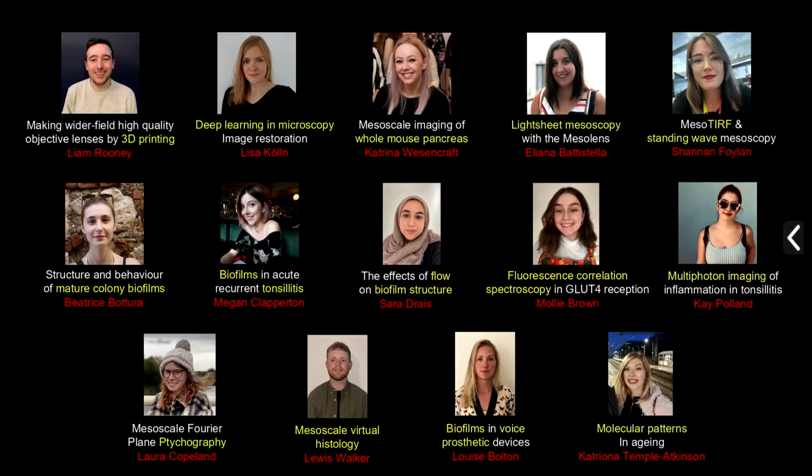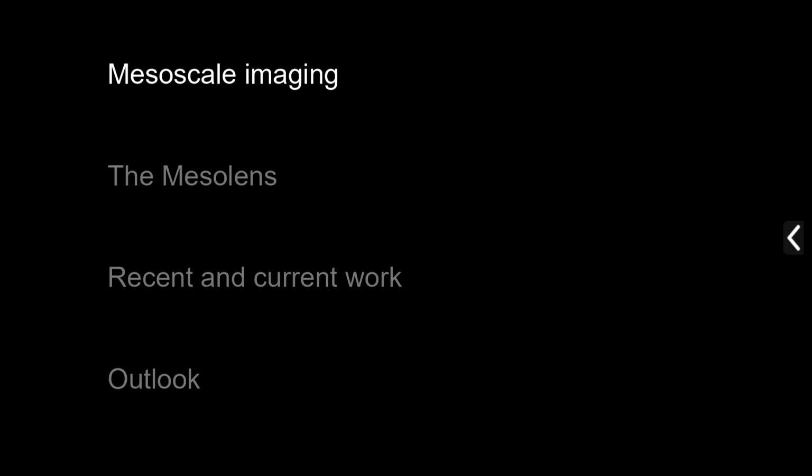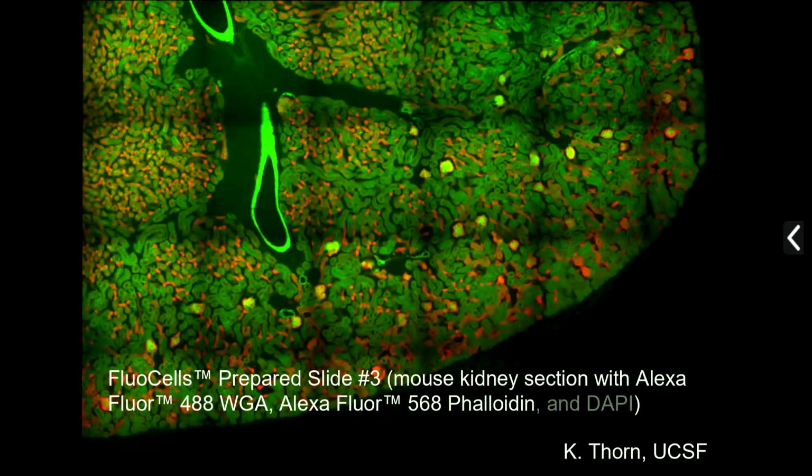But really, our work scales from single molecule right through to mesoscale imaging, and it's mesoscale imaging that I'm going to be talking about today. And the mesoscale imaging arises because we want to occasionally study objects that are larger than a normal light microscope can see without compromising on the amount of resolution detail.